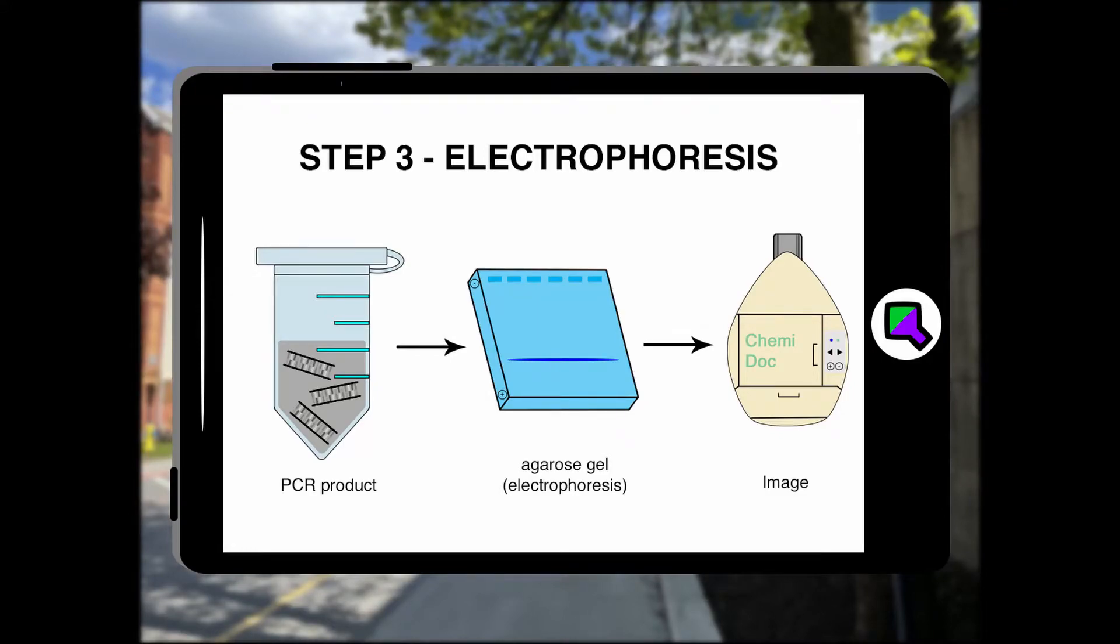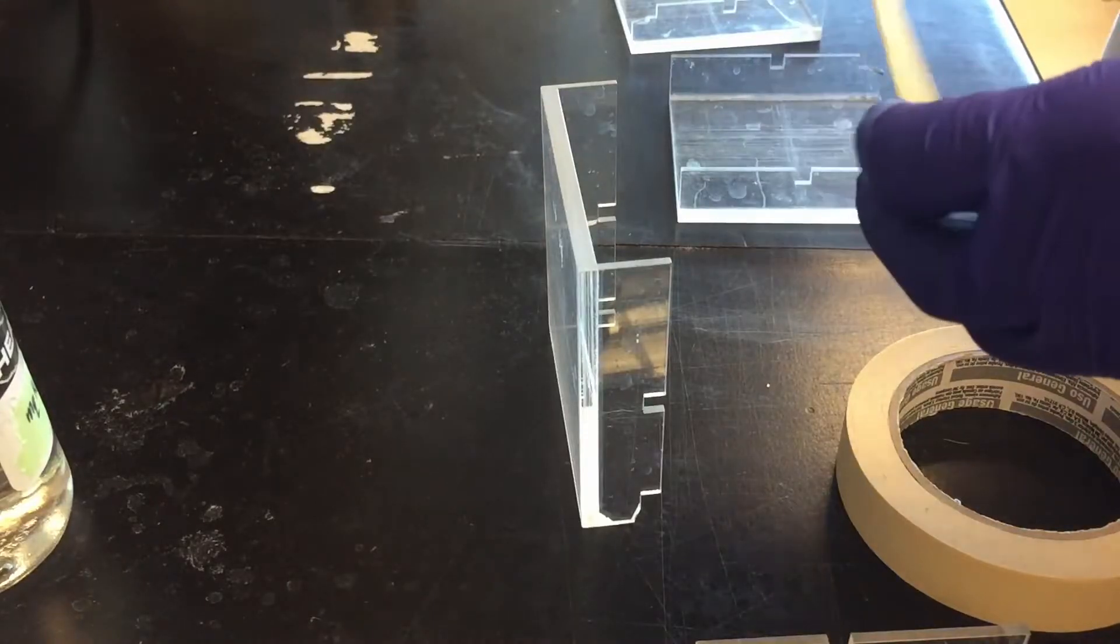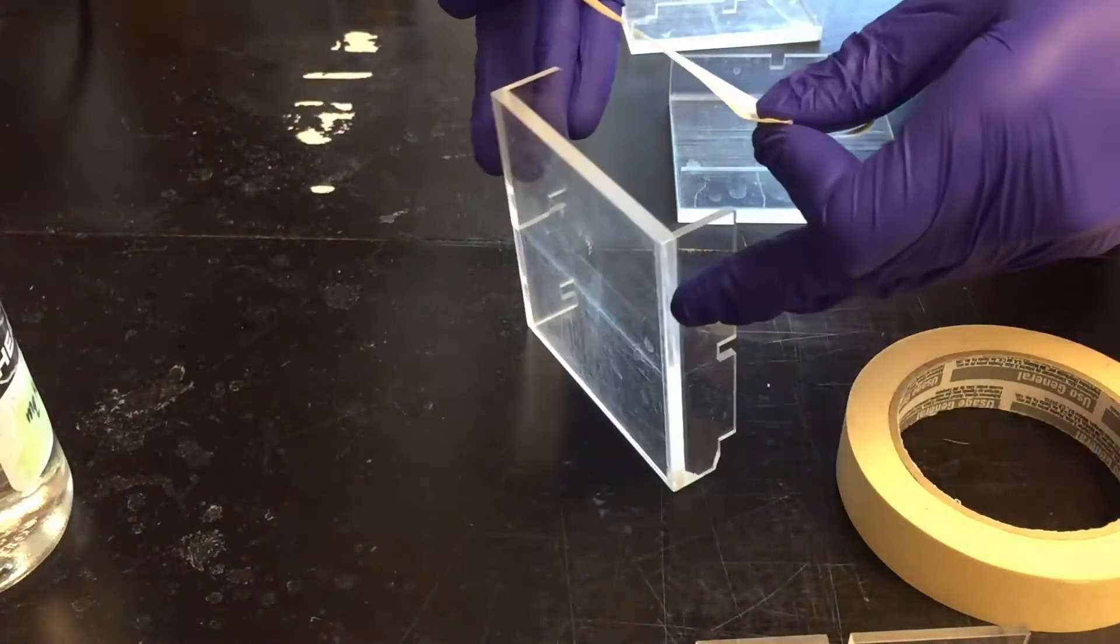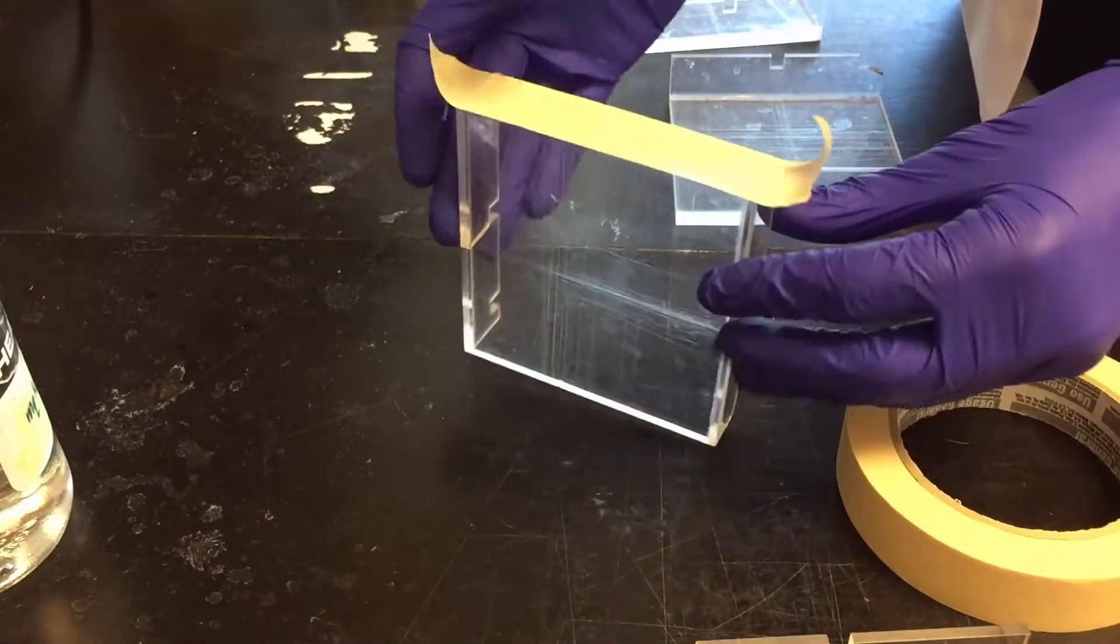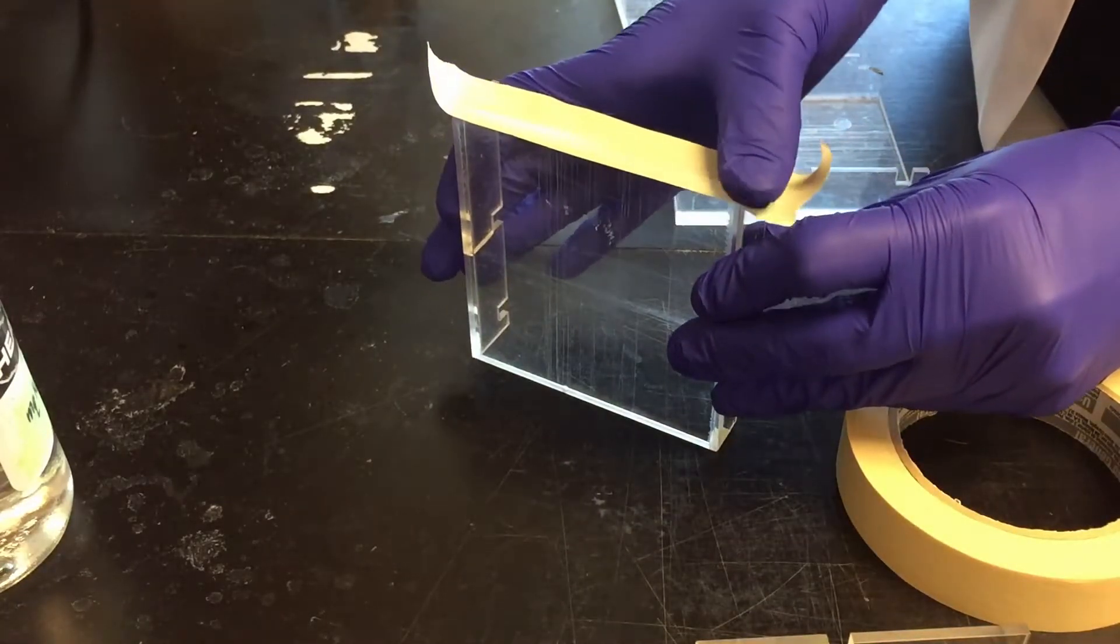Step three is to make an agarose gel so we can check the PCR. Most gels are made in a buffer tank with a gasket but I just use the cassette with tape when I'm making a bunch of gels and I don't want to use a bunch of tanks.